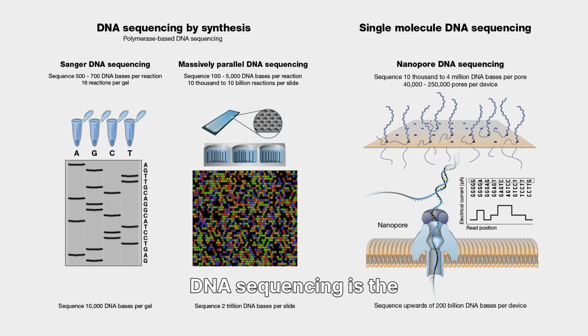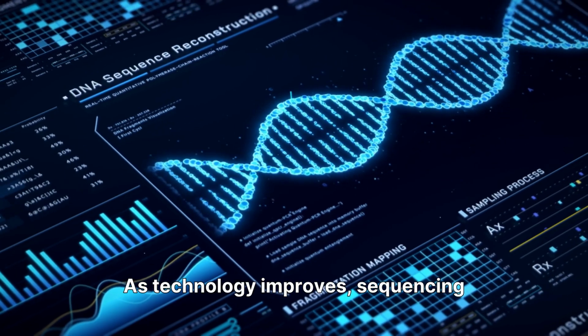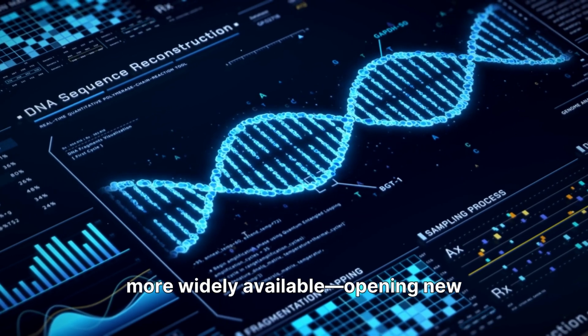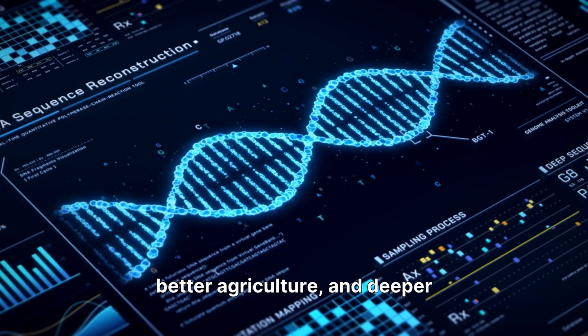DNA sequencing is the process of reading the genetic code that shapes every living organism. It has revolutionized science and medicine by allowing us to understand how genes influence health, disease, and evolution. As technology improves, sequencing becomes faster, cheaper, and more widely available, opening new possibilities for personalized healthcare, better agriculture, and deeper biological knowledge.